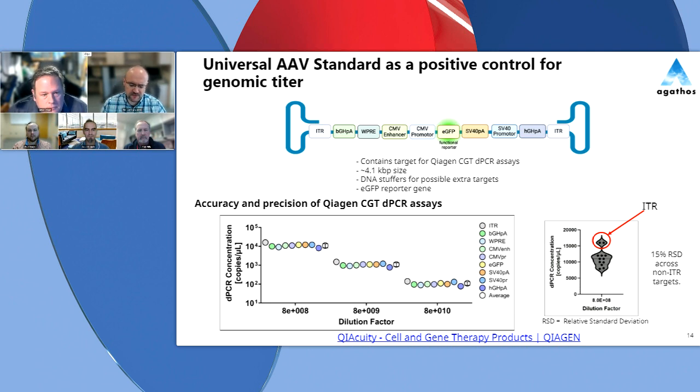In time, this tool became relatively valuable. We could start assessing genomic integrity, because now we have multiple well-characterized assays developed for those targets across the template of the gene of interest. We don't have to necessarily use the longest fragments, but can look at shorter fragments and various different populations of the DNA encapsulated in AAV, giving a more detailed description of that content. That's the basic idea of why that standard exists.